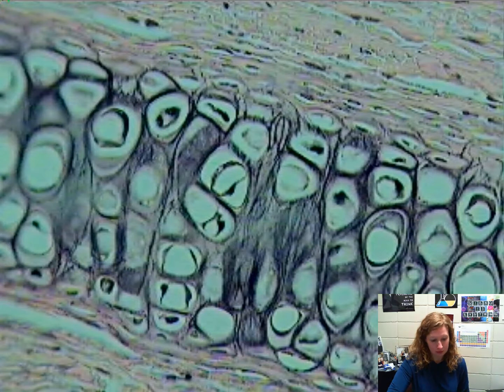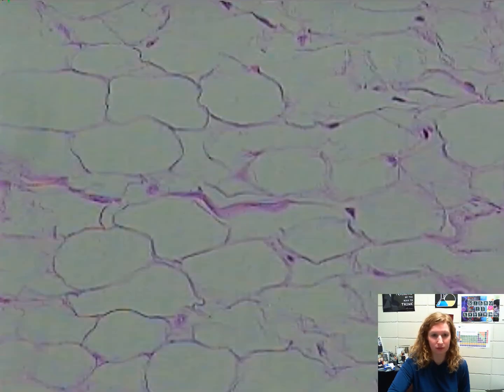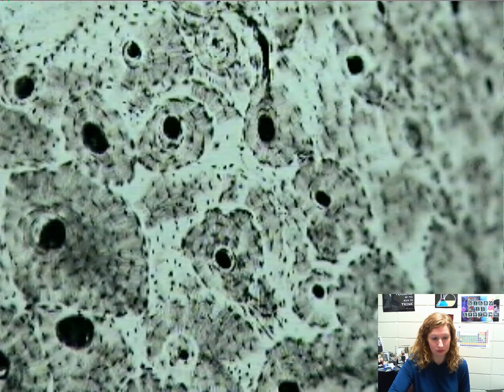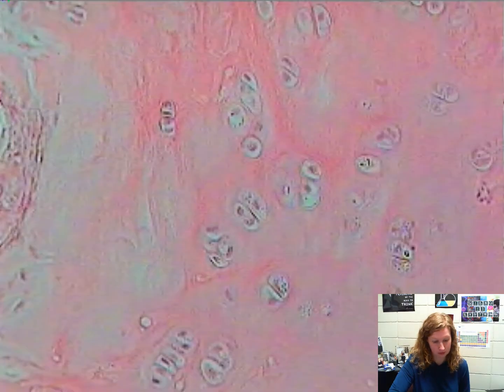All right, here's our connective tissue quiz. Elastic cartilage, adipose tissue, blood, hyaline cartilage, bone, fibrocartilage.